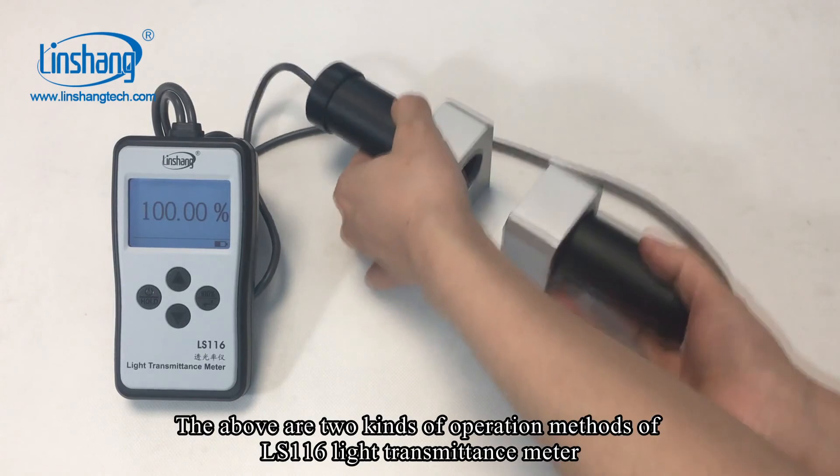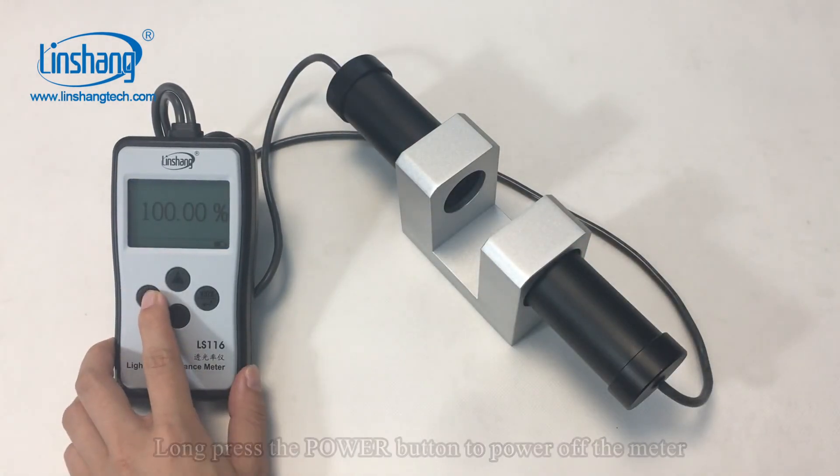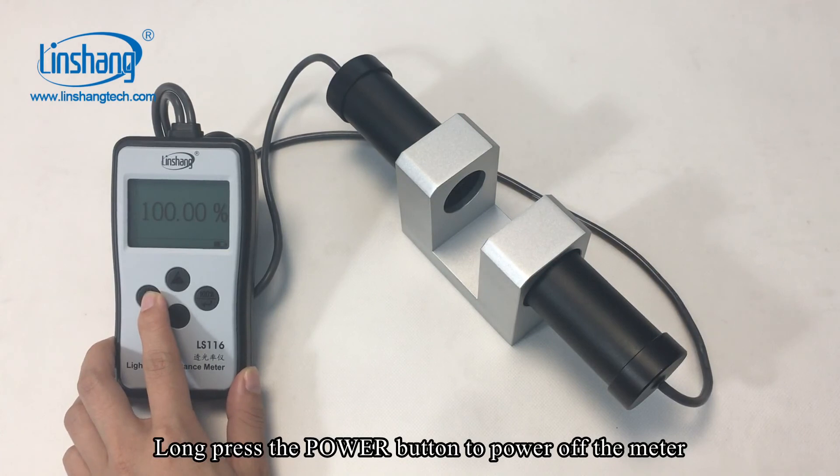The above are two kinds of operation methods. Long press the power button to power off the meter.